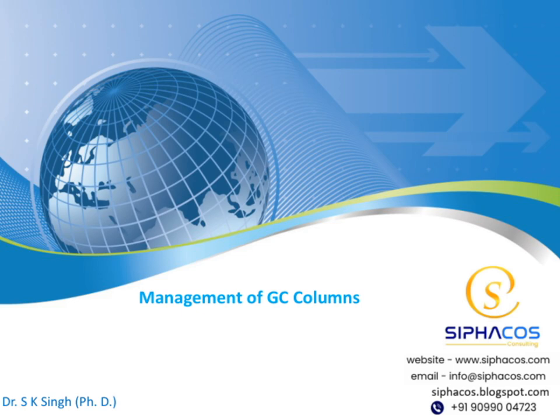Today's presentation is titled Management of GC Columns, and I'm excited to guide you through this important topic. We'll be covering key aspects of GC column management, including best practices and troubleshooting tips. So let's get started and explore how to optimize the performance of our gas chromatography columns.